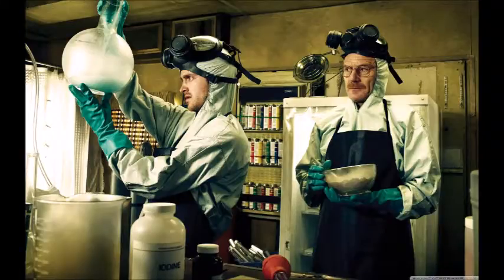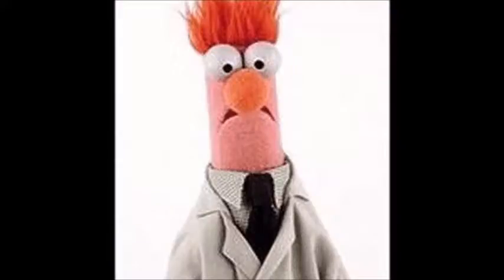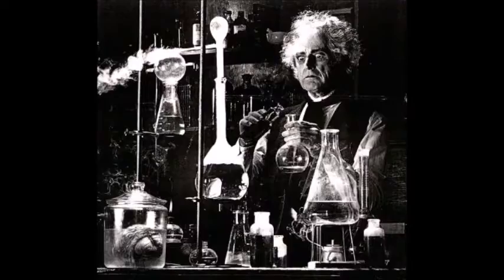That being said, this machine is not for any Joe Schmo who can test a sample's pH. No, HPLC is a finely tuned analytical dynamo that needs the time and patience of a skilled lab technician. Although easy to use, this machine needs constant upkeep, and the components can be highly expensive, so care and caution must be taken when dealing with any HPLC apparatus.